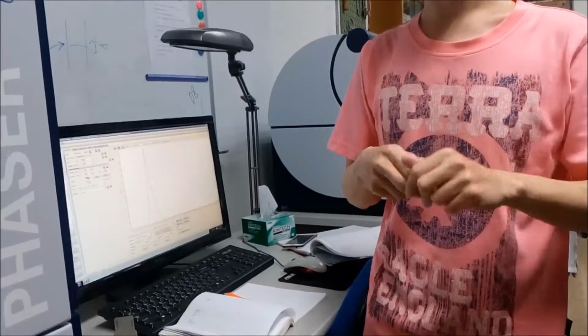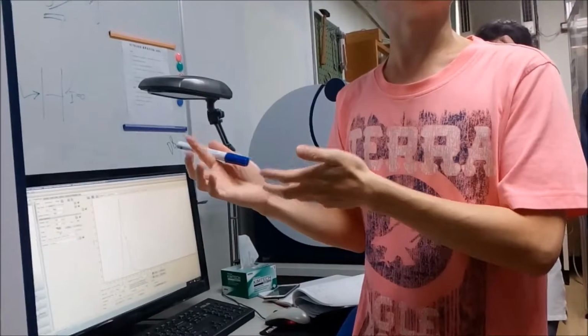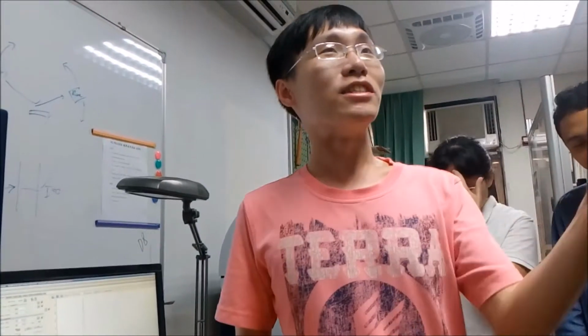You can see the phase changing at different temperatures. That is the in situ experiment. It's been broken a long time. I don't know the real reason, because it was already broken when I came here.